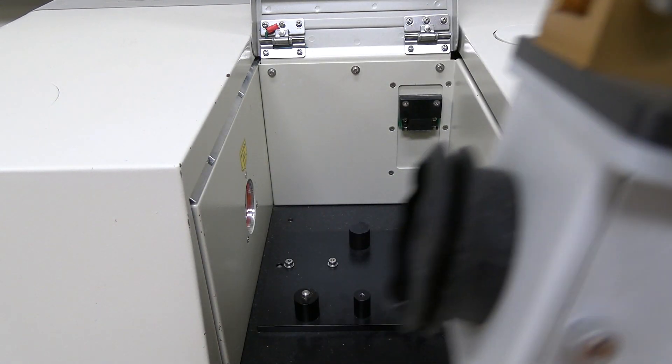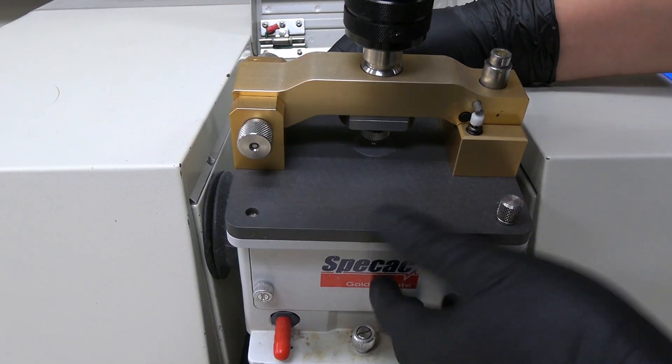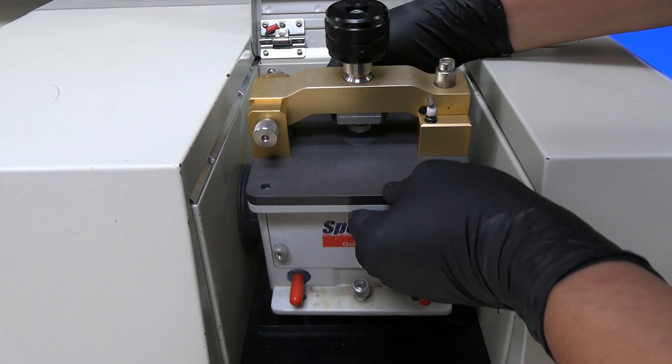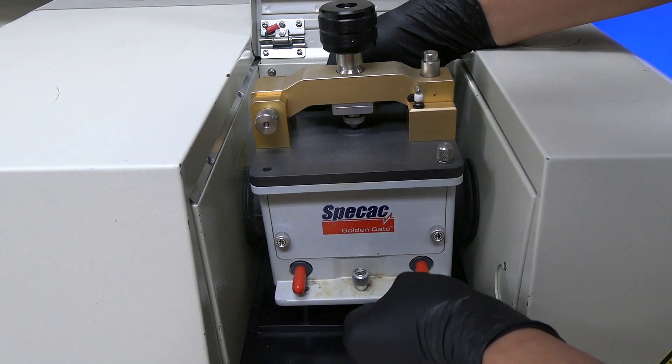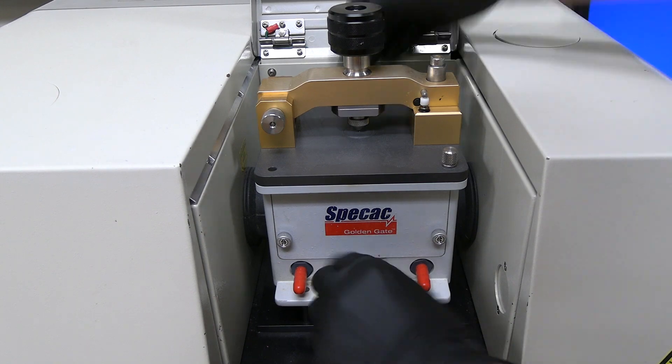Insert the ATR into the sample chamber. You will need to compress the covers on each side of the ATR. There are pegs that align with two holes on the front of the ATR. Press down and tighten the thumb screw on the front of the ATR.